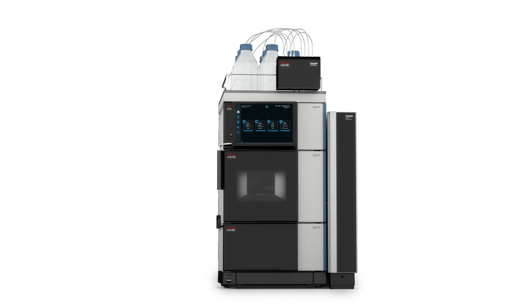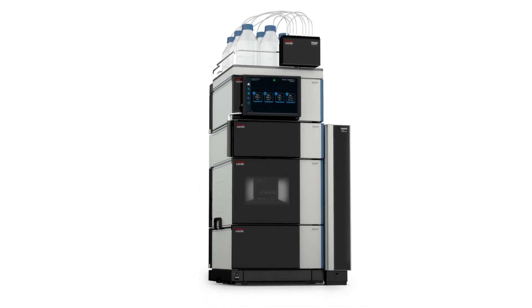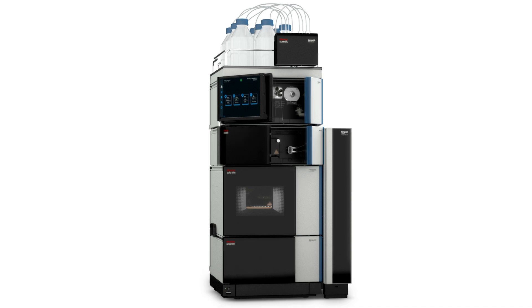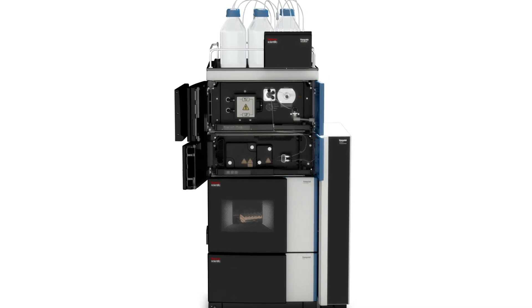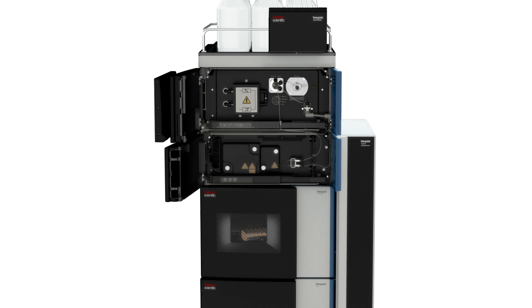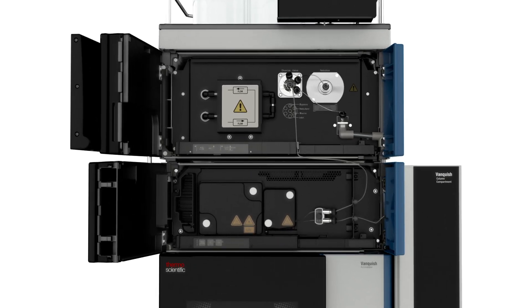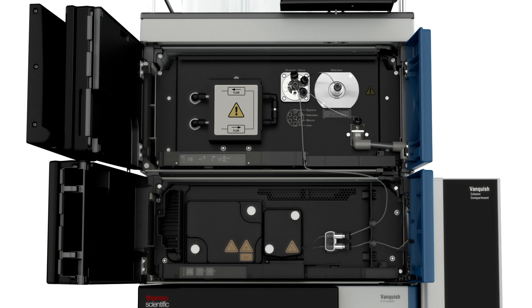With the Vanquish CAD-P series and the modular design of the Thermo Scientific Vanquish LC platform, you can easily connect additional detectors to expand your detection range within the same flow path. For example, you can couple a Vanquish Charged Aerosol Detector with a UV-Vis detector or a mass spectrometer.